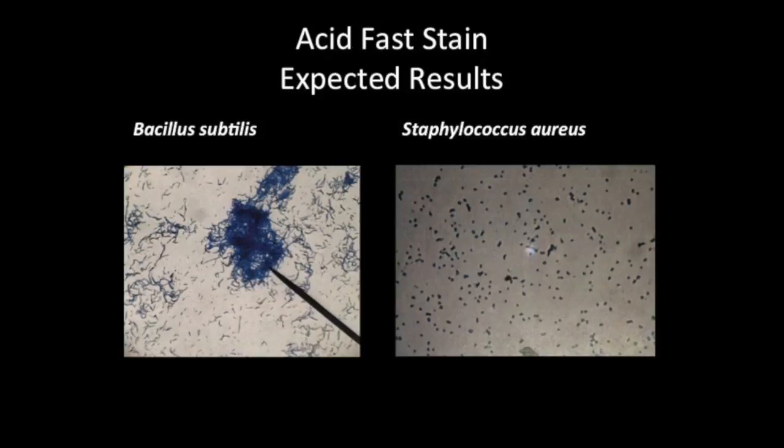Note that you can still observe other morphological details about these organisms. You can still make out the large bacillus shape on the left for Bacillus subtilis, and on the right it is apparent that these are coccus cells for Staphylococcus aureus. The Staphylococcus sample was not incubated long enough to be able to observe clusters of cells.